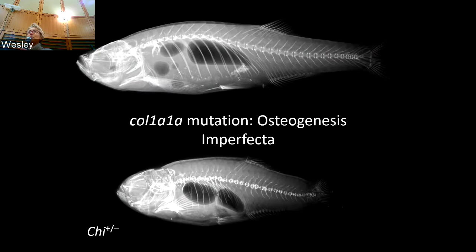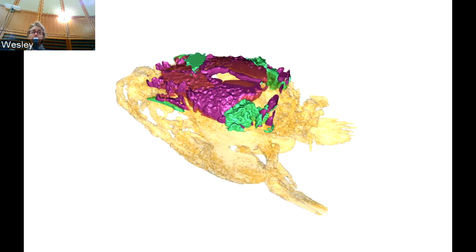So we're still at the early stages in this, but in a set of fish, we've done the complete confocal imaging on the live fish, and then at the end of that experiment, fixed the samples and sent them to the Harris lab for micro-CT scanning. So this is our first attempt at the data integration.